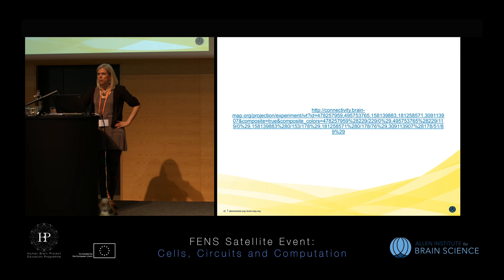Now it's this URL. If you save that URL and you've got a bunch of experiments, the nice thing that you can do is hit 3D Atlas, right? And it will open up all those experiments in the Brain Explorer. Some of you have saved experiments in the Brain Explorer and it was awesome, and you closed the Brain Explorer and they were gone forever, right? So we're working on these kinds of issues with the user interfaces, but especially as we start to add more features, I just want to make sure that until we have created some kind of a fix, people have a workaround for that. So what you want to save is that URL from the correlative view, okay?